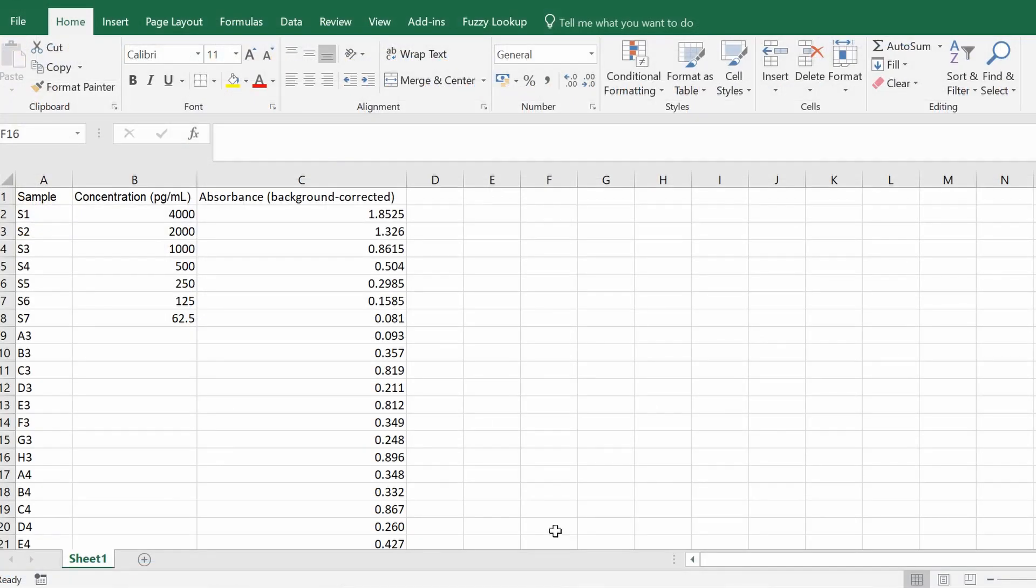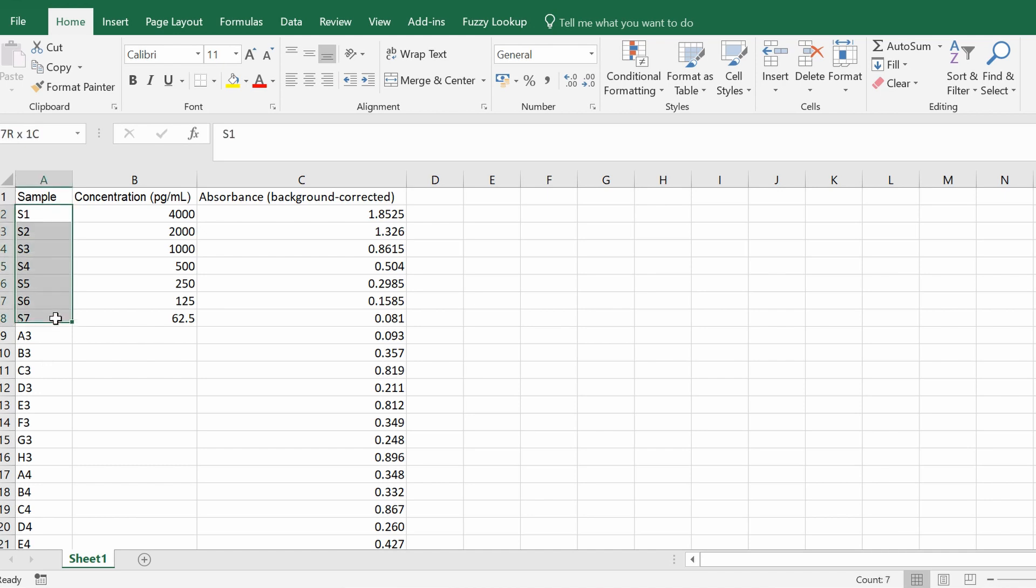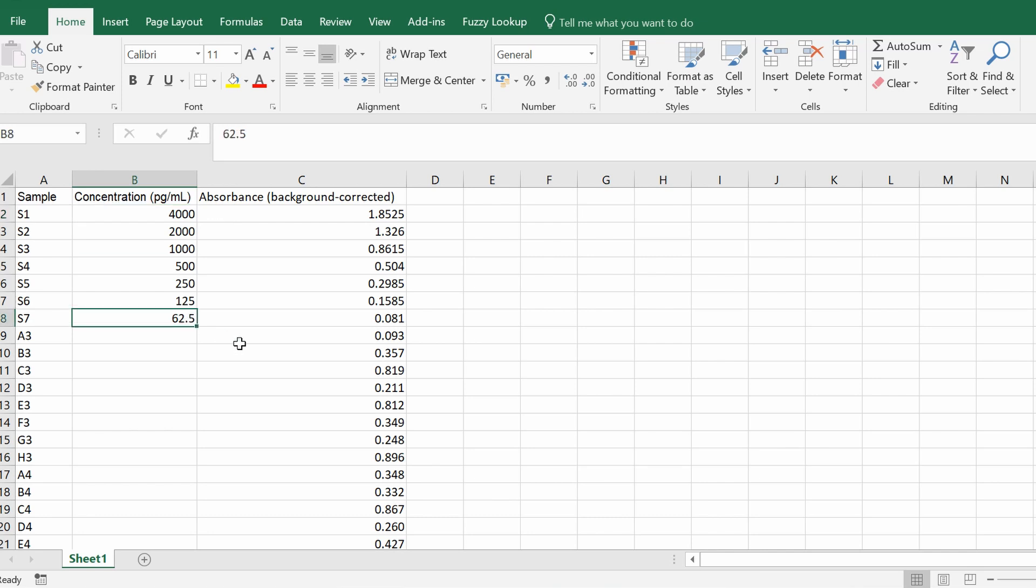So I'm just going to go to Microsoft Excel where my data for this example is stored. I'm just going to briefly talk you through this. What I have on the left hand side are my samples, and the first seven are the standards with the highest concentration at the top and the lowest concentration at the bottom. This example was an ELISA assay, so obviously I know the concentration of my standards and I measured their absorbance.